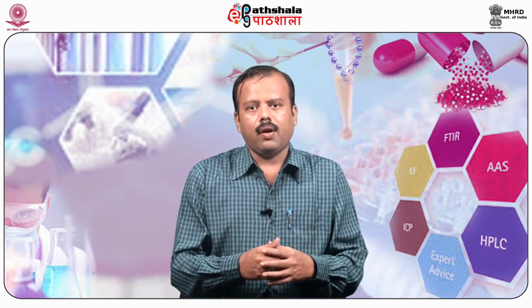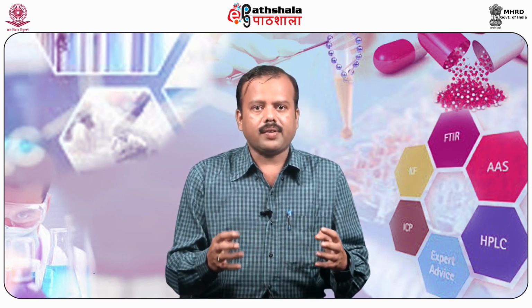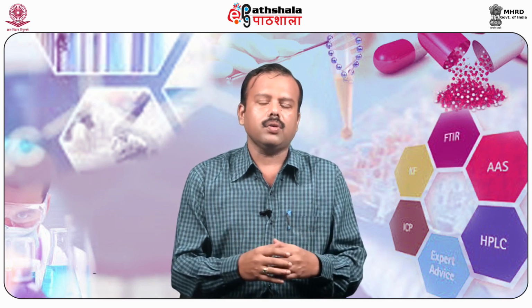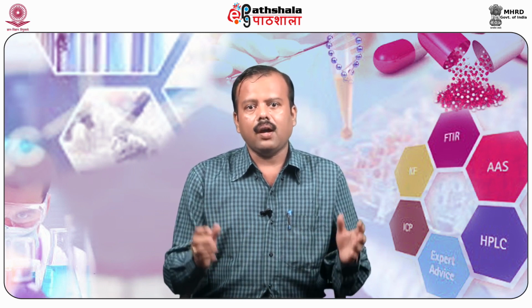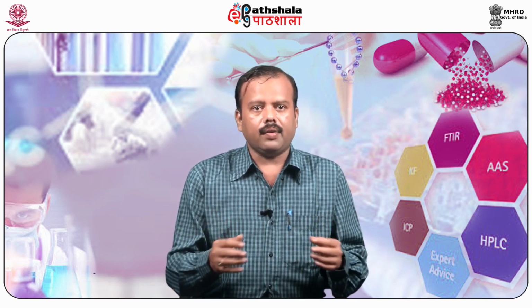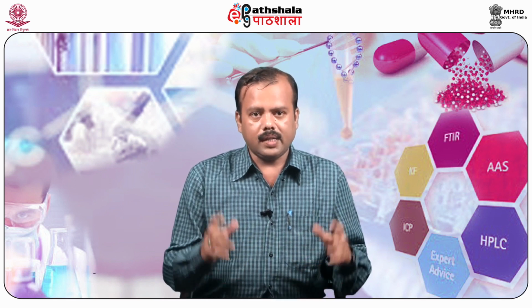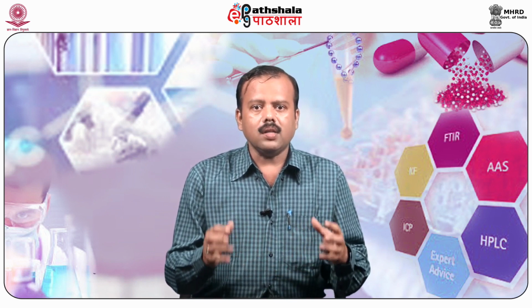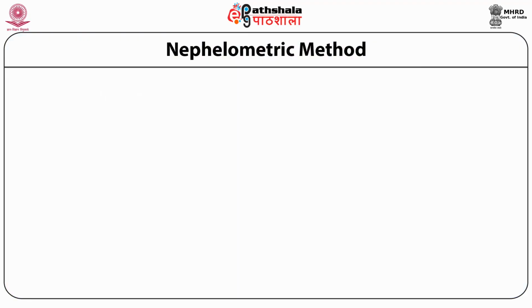Limitations of the carrier test are: the number of bacteria dried on a carrier is hard to standardize. The survival of bacteria on the carrier during drying is not constant. The disinfectant residues are also carried over to the subculture medium.